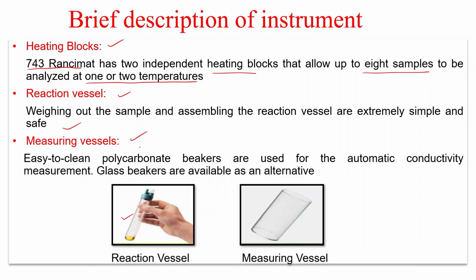Then we have the measuring vessel also. This is easy to clean. Polycarbonate beakers are there.